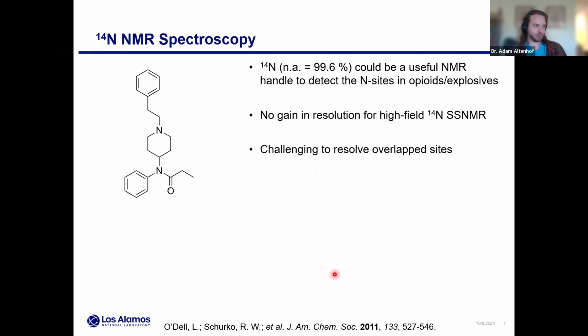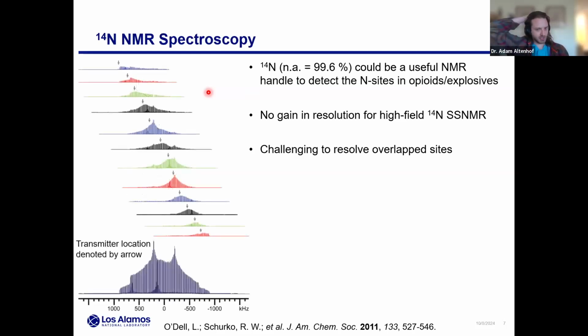So more towards thinking about fentanyl and its detection, recognize these are solids at room temperature. So we're not going to do proton NMR, right? The dipolar coupling makes for very low resolution. Carbon and oxygen are extremely low abundance. 14N starts to become pretty interesting, right? That's basically 100% abundant.